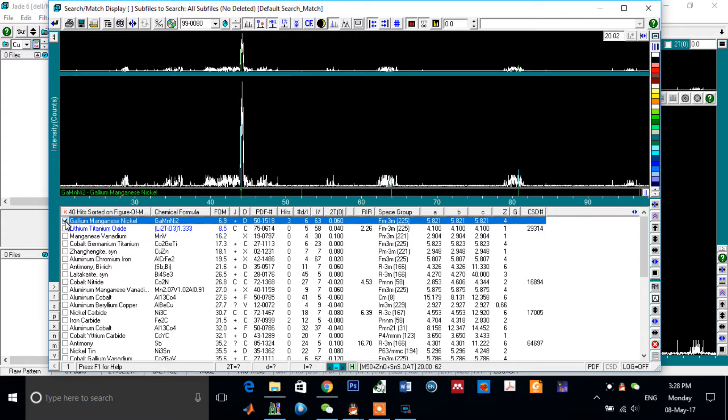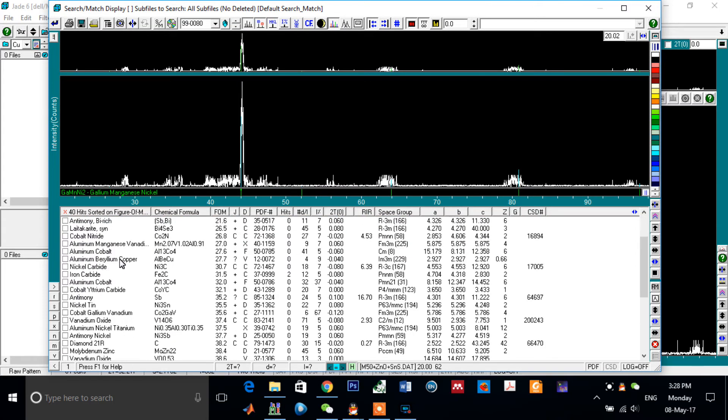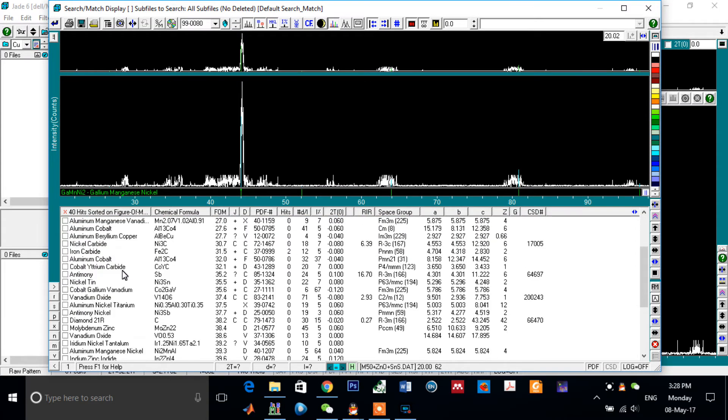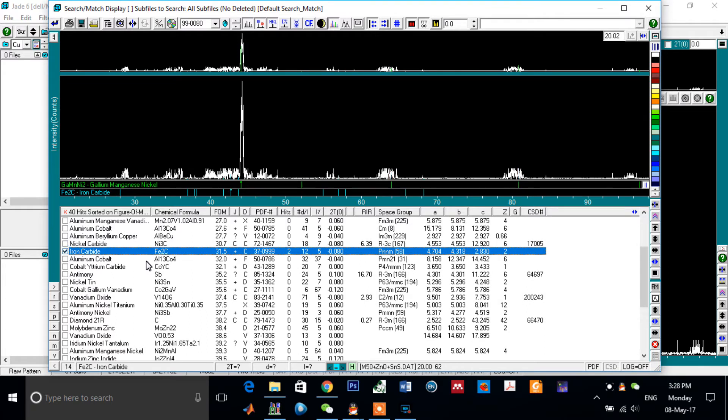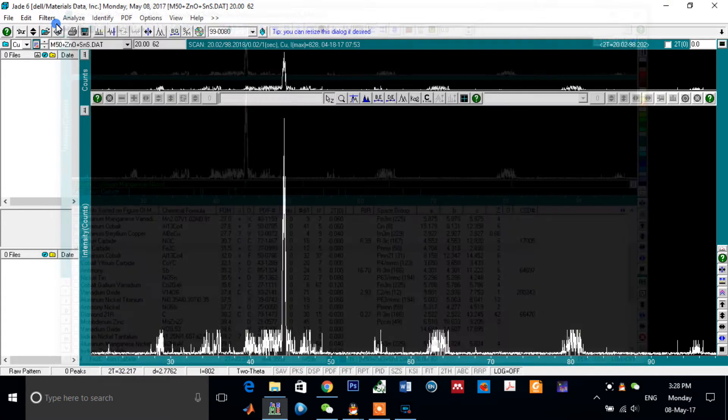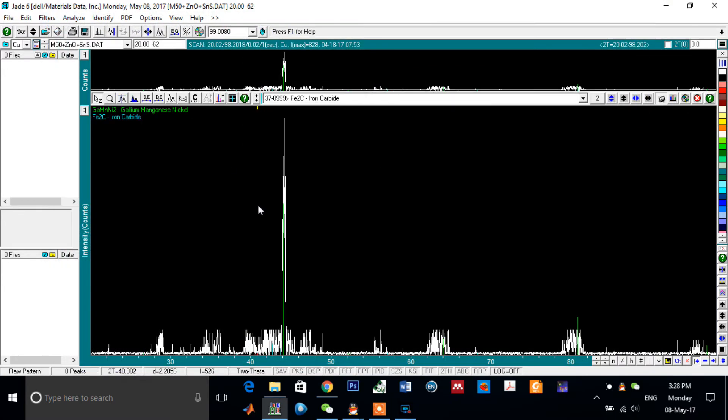For example, I can choose this one. And I am searching for iron carbide because these elements are deposited into my sample as powders. And after that, click here. Okay.